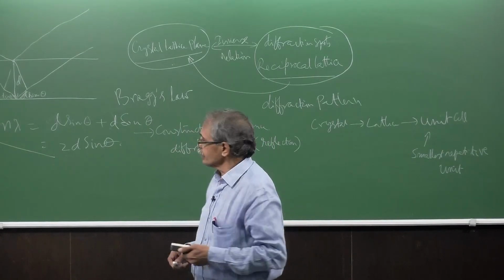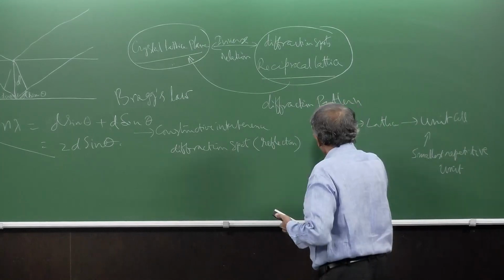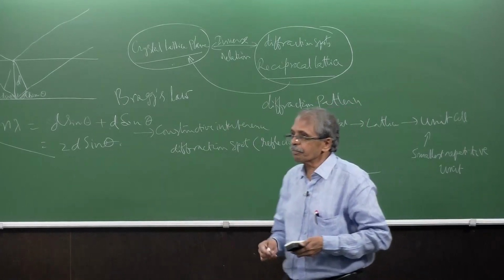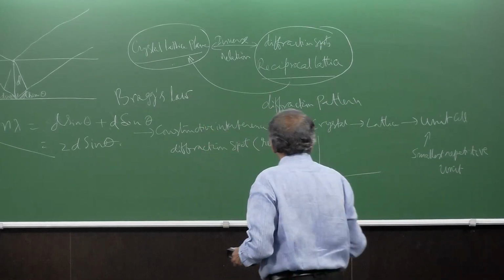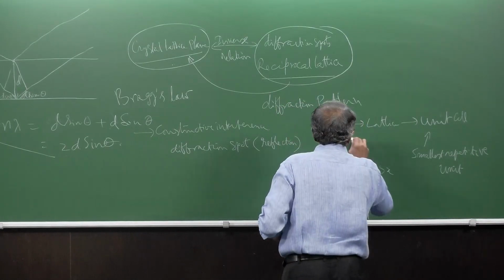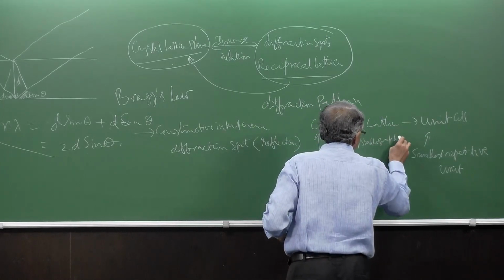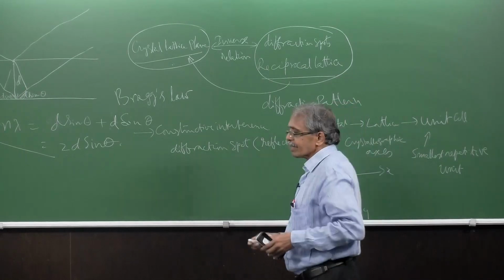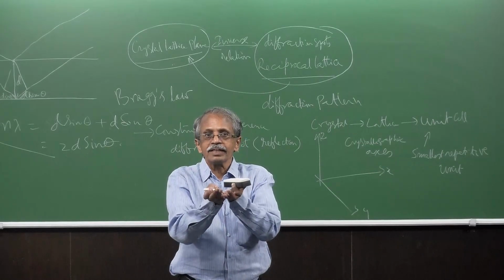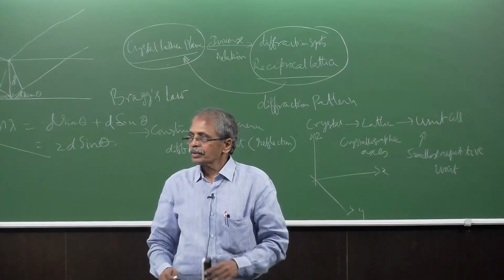Okay, and where these unit cell axes intersect, that is basically the crystallographic axis. It can be Z, it can be X, it can be Y. These are referred to as the crystallographic axes. So crystallographic axes are the ones emanating from the unit cell, where these axes will have a common intersection point. So that is what it is.